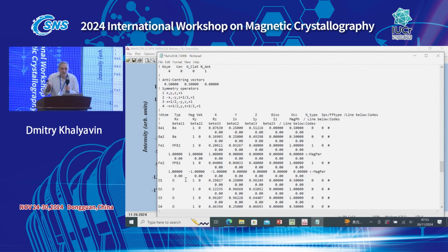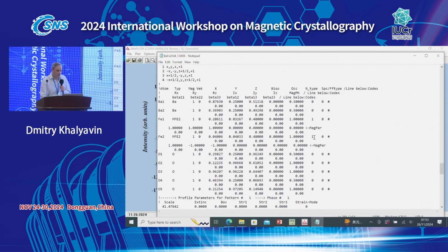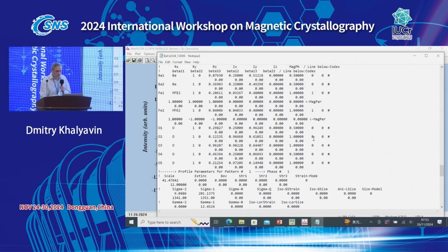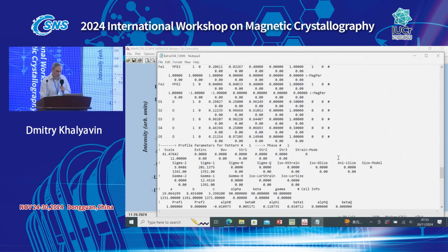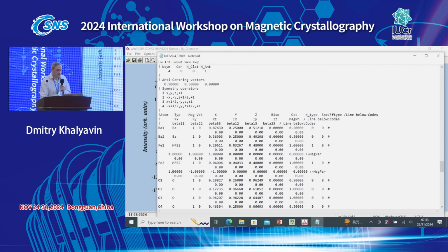Nobody tells you which start will be good in order to find the solution. Every time it will be different. But this is not a super complicated case, so I think we should not struggle too much to find our solution. Okay? Let's just refine and see.